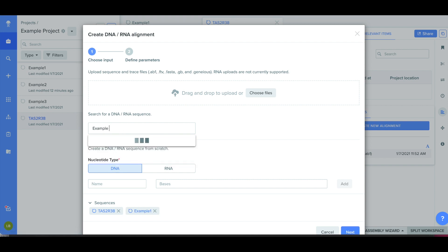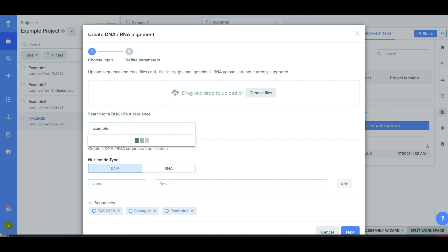I'm typing in the names of the three sequences that I have: Example 1, Example 2, and Example 3. Once I've done that, notice that they pop up in the Sequences box at the bottom.